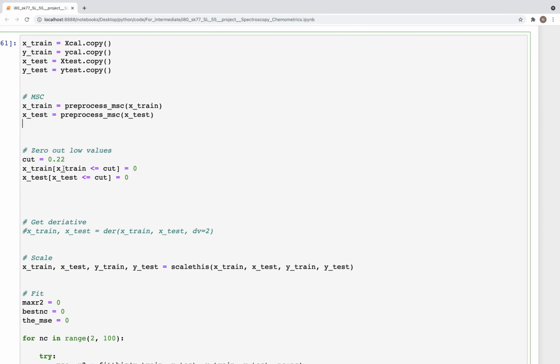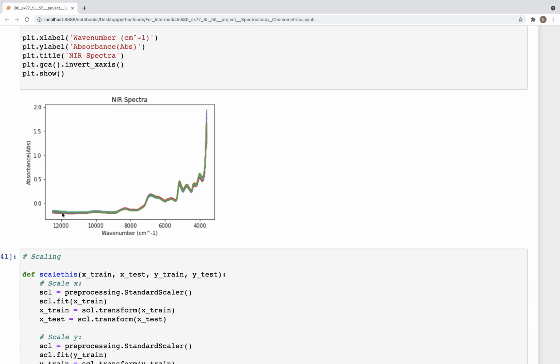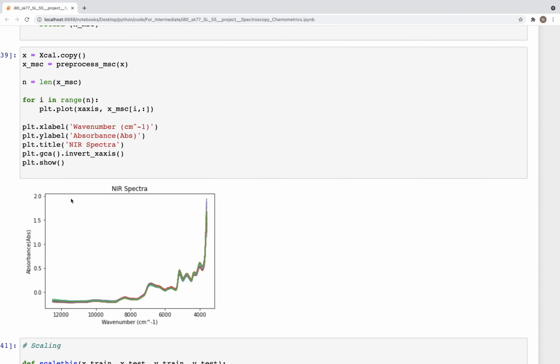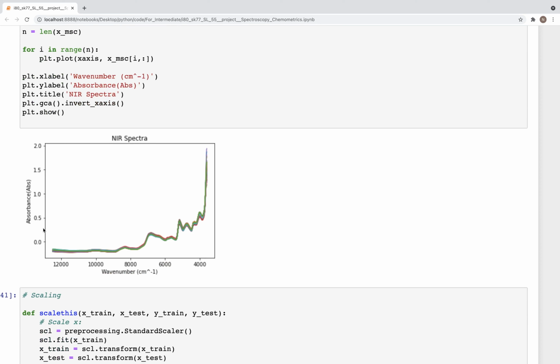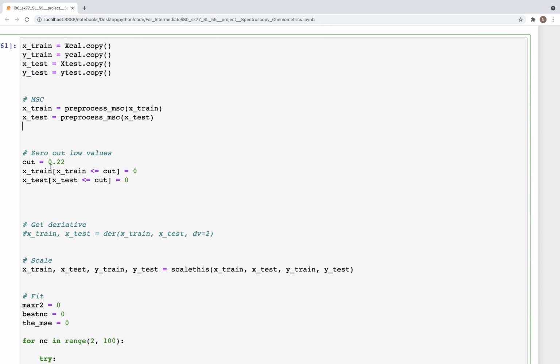But then when we do the thresholding here, the thresholds are going to be different, because if we try to threshold at 0.2, we'll be removing a lot of data. So the thresholding would have to be somewhere at around, so this would be minus 0.5, and this would be minus 0.25, so somewhere around that. Let's try this. So minus 0.22 or 20, and let's run this.